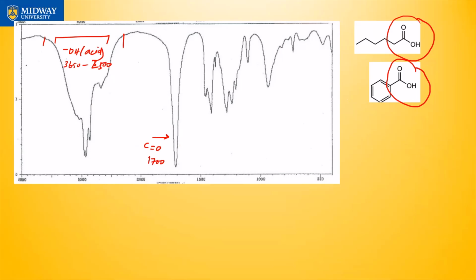What is really the giveaway again is the tooth. This tooth right here, it's there. It's being overlapped by this giant peak. It's like, you know, that you have big peaks in Yosemite, but because there are so many other mountains in front, you can't see the actual peak that you see in all photographs from every angle because it's been overshadowed, right?